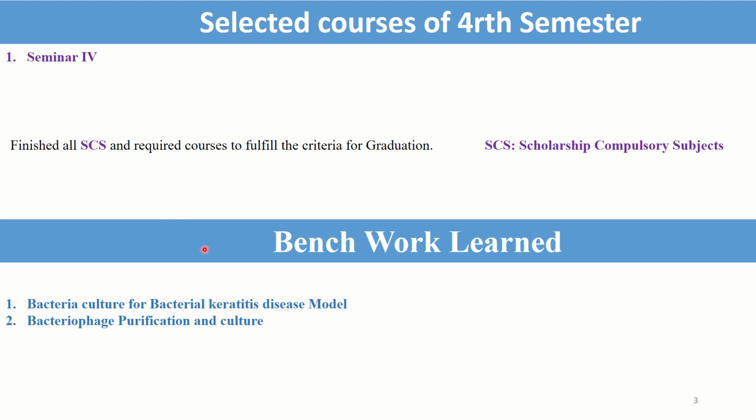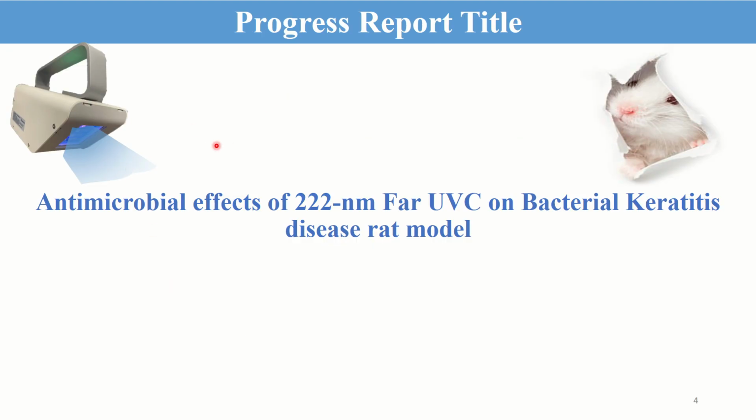This is the bench work I learned this semester: bacterial culture for the bacterial keratitis disease model, and bacteriophage purification and culture. The title of my project this semester is the antimicrobial effect of 222 nanometer far-UVC on a bacterial keratitis disease rat model.